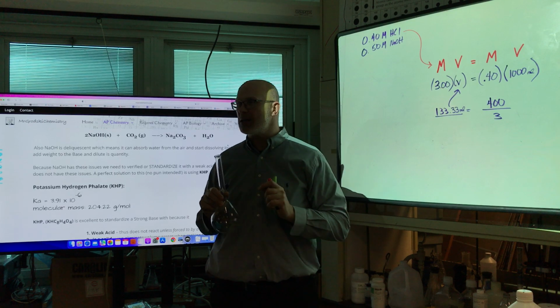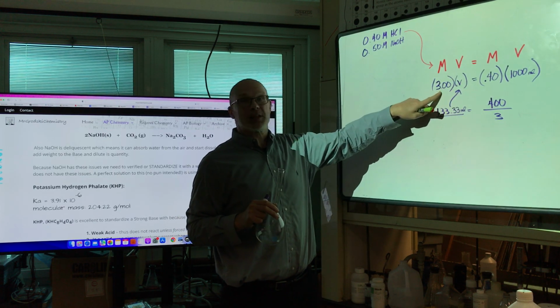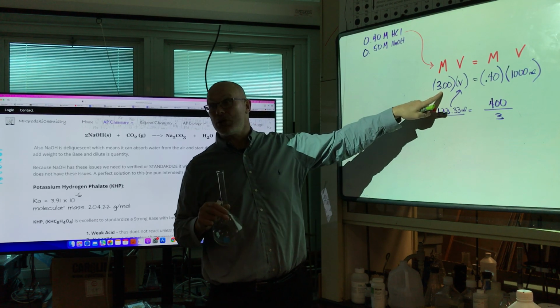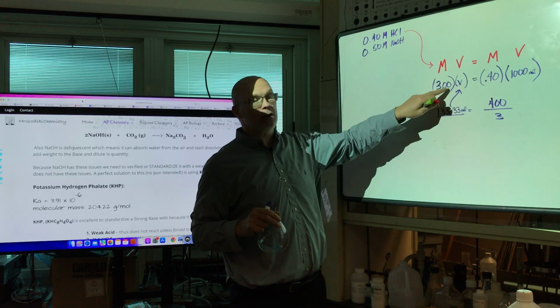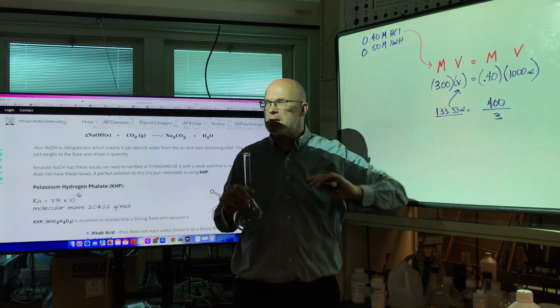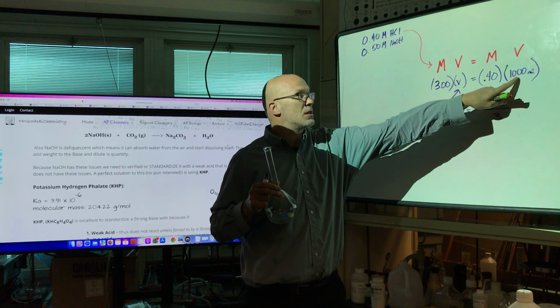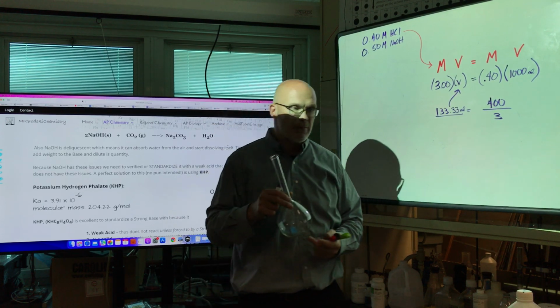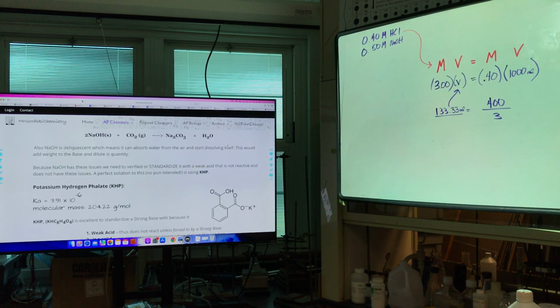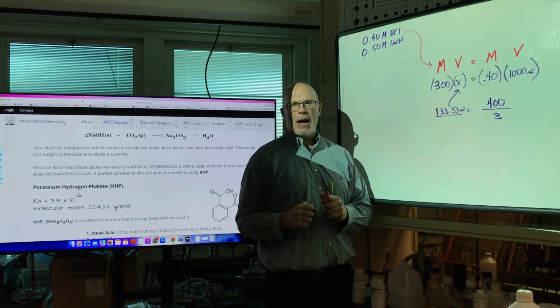because just on that line is now 1 liter. So in this dilution formula, we solve for how much of the stock solution we need. They call it a dilution formula because you're figuring out how much of the more concentrated solution you need to dilute. People mess this up all the time. They know how to solve this easy math, but they don't know what it means. We're going to dilute this to this value. You notice we're starting with 3 molar, and now we're down to 0.4. And I have that solution made. And of course, today we're going to measure 100 milliliters of it to add to our tabs that are crushed. So that's an easy one.